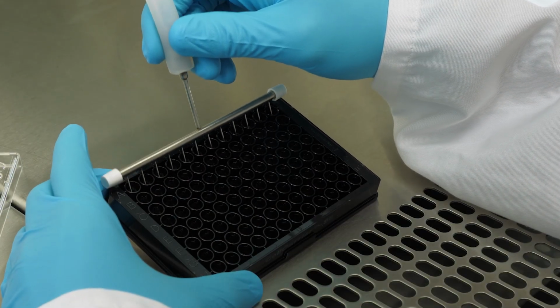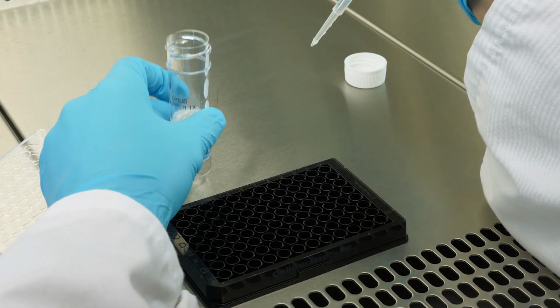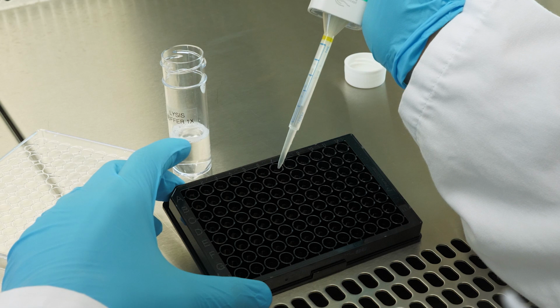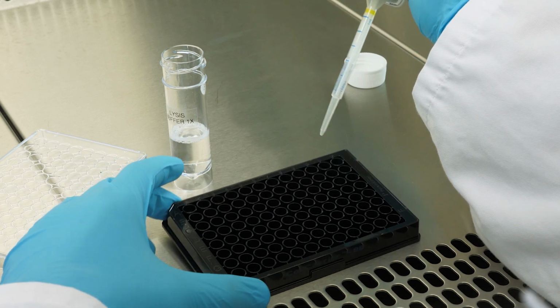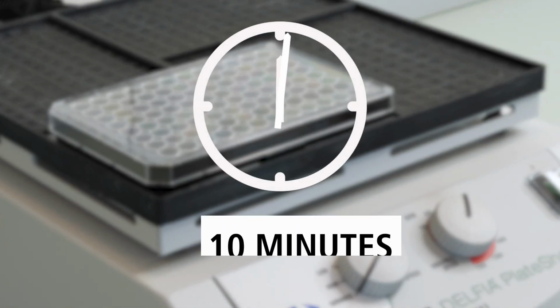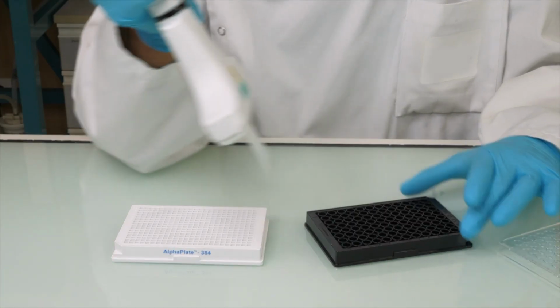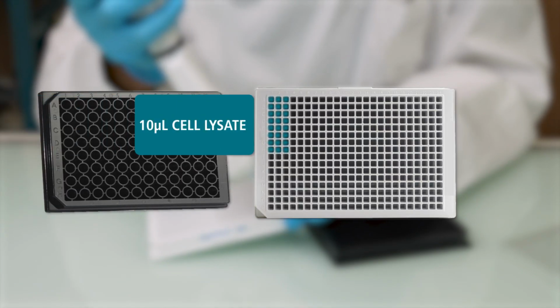If working with adherent cells, remove culture medium from the stimulated cells and replace it with 1-fold diluted lysis buffer. If working with suspension cells, just add 5-fold lysis buffer on top of the cultured cells. Make sure to put the plate on a plate shaker for 10 minutes at room temperature. Transfer 10 microliters of the cell lysate to the immunoassay plate.